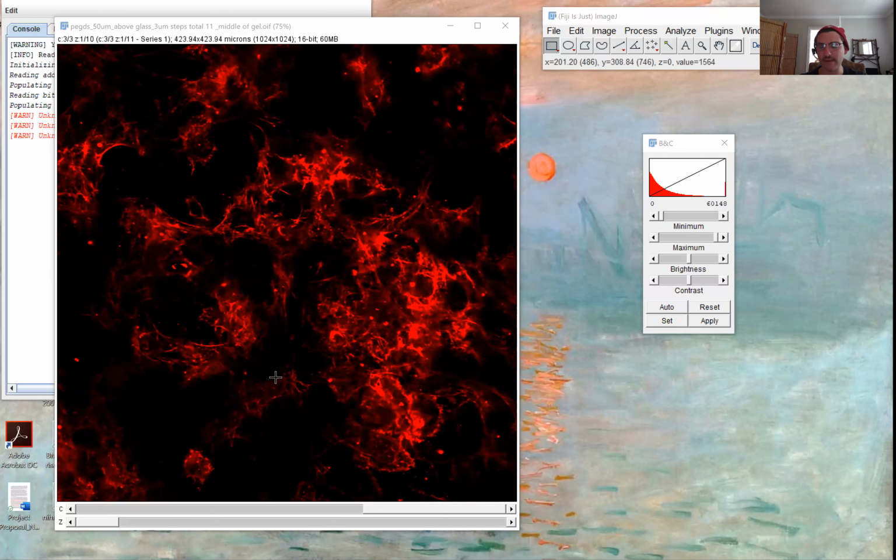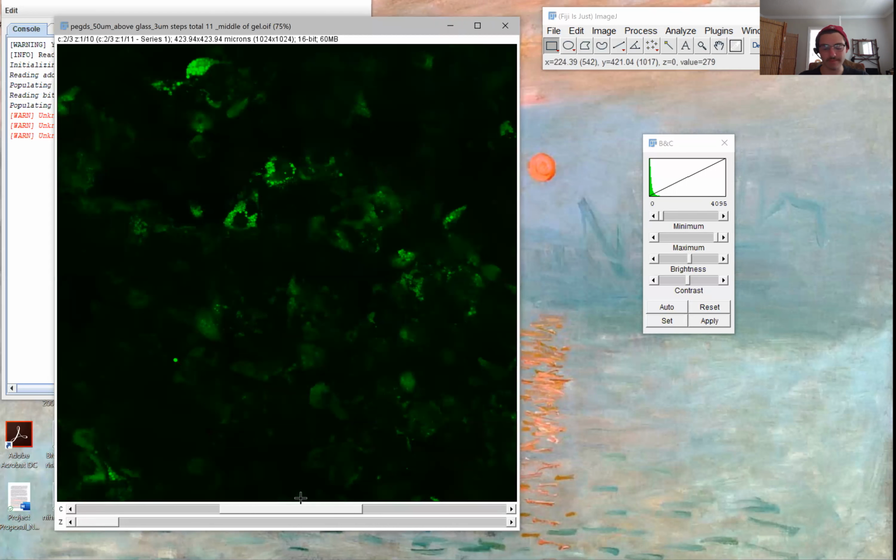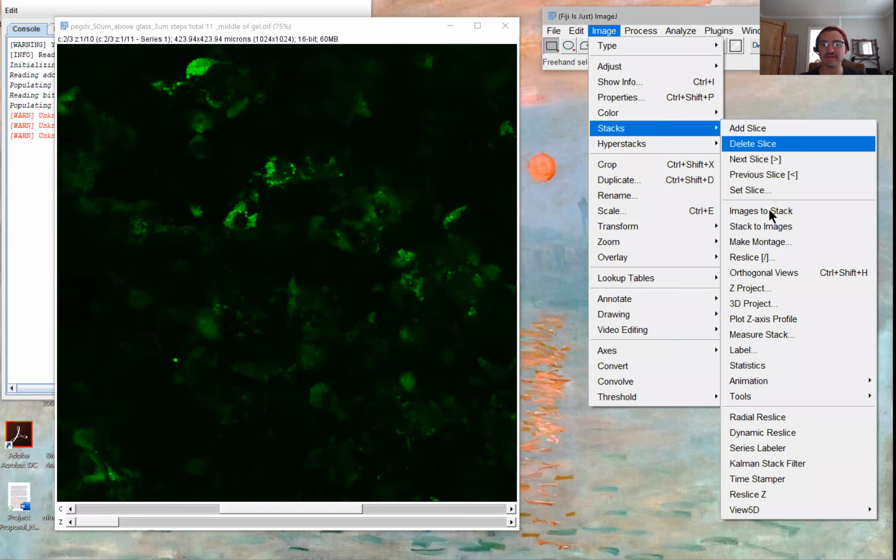The next thing I want to show you is how to do a Z-stack. What a Z-stack does, or we call it max projection, is that we have, say, 10 slices, and we want to overlap them all into one slice, so we're able to have a 2D planar image that's representative of a 3D object almost. You can go to Image, then Stacks, then Z Project.